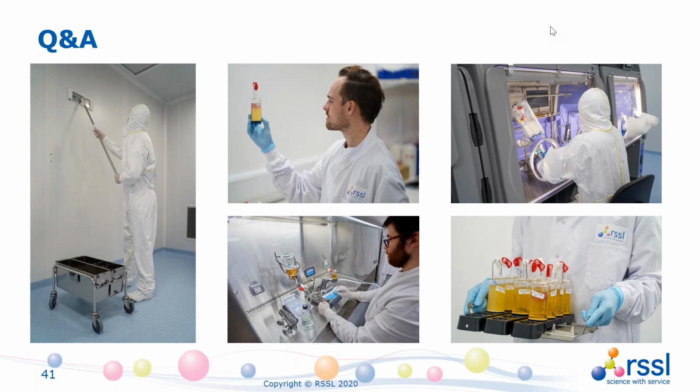Okay, I remember that from your previous webinar. Kelly asked, can you justify to not perform the suspension test at all in preference to just use surface testing and field trials when validating disinfectant efficacy? Yes, I think you can. And I think there's been a great shift in the industry towards this.